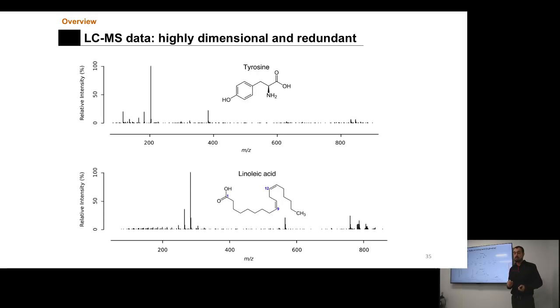And why do we need that? Why do we need algorithms that effectively perform that process? Because we still try to answer how many compounds we are profiling in a typical untargeted metabolomics experiment. We're still talking of features when we do an untargeted experiment, and at this point, we should be talking about compounds. And this is one of the reasons why we cannot answer this question: there is a lack of good, or at least effective, algorithms capable of grouping all the features that stem from the same metabolite and telling us how many metabolites we are observing in a typical metabolomics experiment.